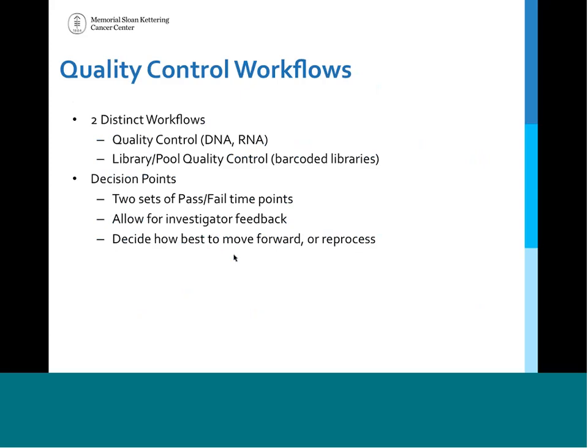One thing that we've worked out recently is we decided to build into different quality control workflows this idea of a decision point. So we have 2 quality control workflows that we utilize, one for nucleic acids, and we utilize this when nucleic acids are coming into the core or after an extraction workflow has completed. And then we have another quality control workflow that we utilize for libraries or pools. At the end of this QC, we have the ability to decide whether or not samples pass or fail, and it allows us to also get investigator feedback.